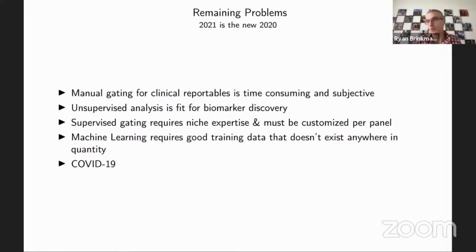So you need to see your sick people, your healthy people, so you have some idea of the breadth of heterogeneity, but we know pretty much what a population is going to look like by and large. And like I said, it's always worked, but it has to be customized. And the customization step takes time, right? So this is unlike an unsupervised algorithm, where we just throw it at your data without pushing any buttons. So it can take a couple of weeks or more to set this up per panel. I think our average is around 2.5, maybe 3 weeks per panel.